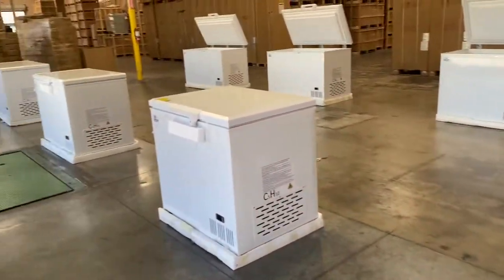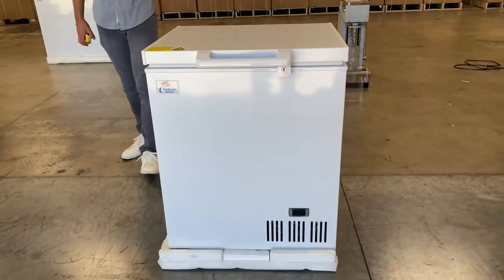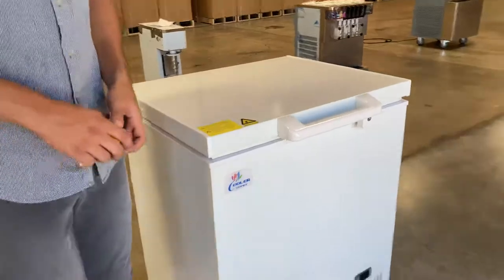We're going to have four different sizes available. These freezers can reach temperatures of negative 65, so they're ultra low temperature freezers.